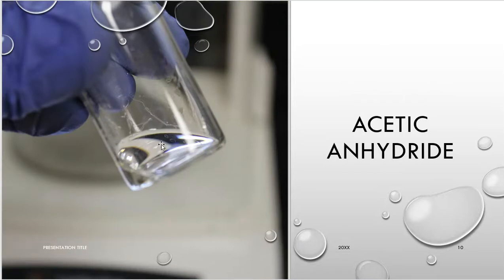The acetic anhydride is here. Again, nothing special about it. Just this weird little smell. Some people think of a minty smell, but I think of this vinegary smell. I don't know how you can get them confused, but that's just what my nose tells me. So this is a very clear solution, colorless, of course. It just really looks like water there.